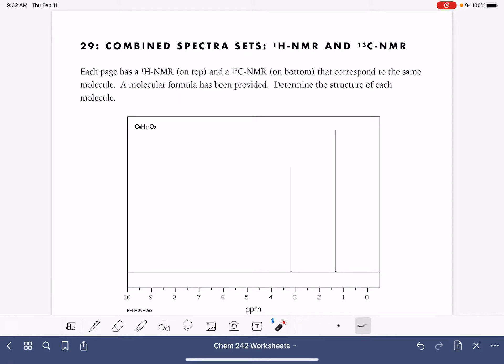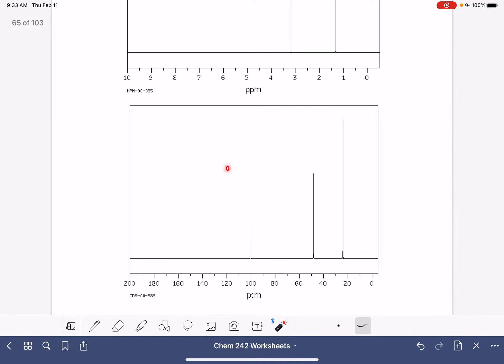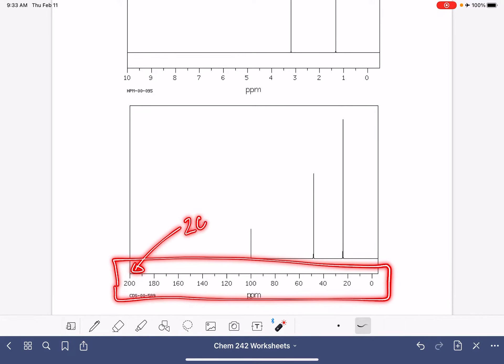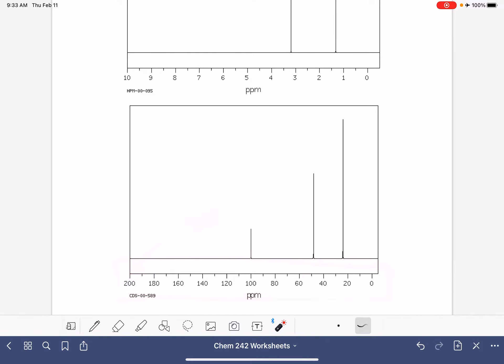On this worksheet, we are going to be determining the structure of a molecule from its molecular formula, its proton NMR on the top of the page, and its carbon NMR on the bottom of the page. One way to tell proton from carbon NMR is the PPM scale. In carbon NMR it goes all the way up to 200, while proton NMR typically only goes up to 10, sometimes 15, but never 200.